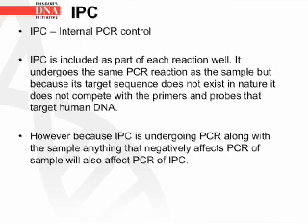Let's talk about the IPC. The IPC stands for Internal PCR Control. The IPC is included as part of each reaction well. It undergoes the same PCR reaction as the sample, but because its target sequence does not exist in nature, it does not compete with the primers and probes that target human DNA. However, because the IPC is undergoing PCR along with the sample, anything that negatively affects the PCR of the sample will also affect the PCR of the IPC.